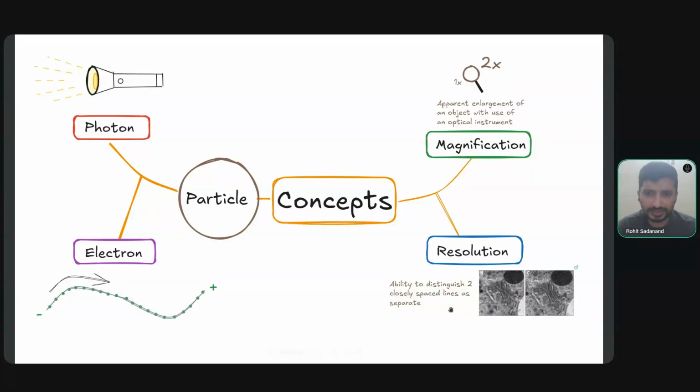And these two things are actually kind of antithetical to each other. When you try to increase magnification, the resolution tends to come down, and vice versa.